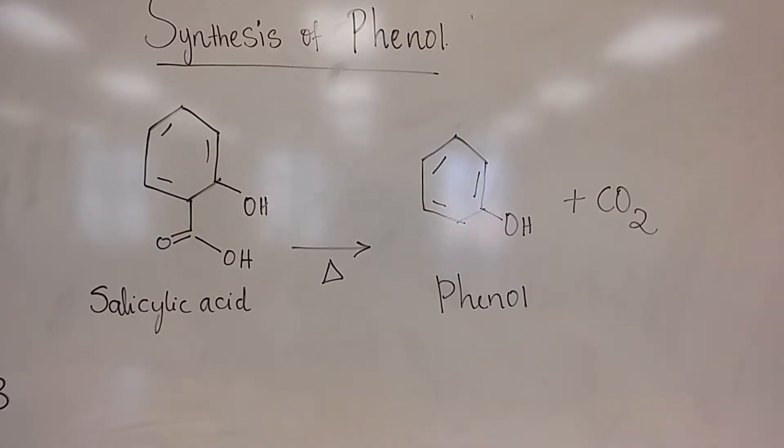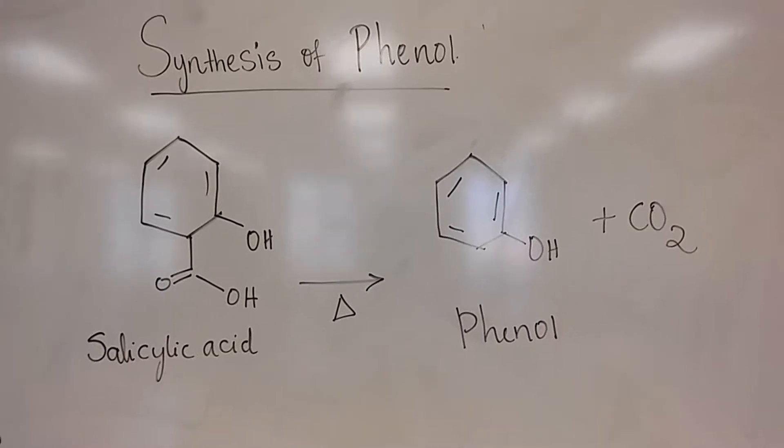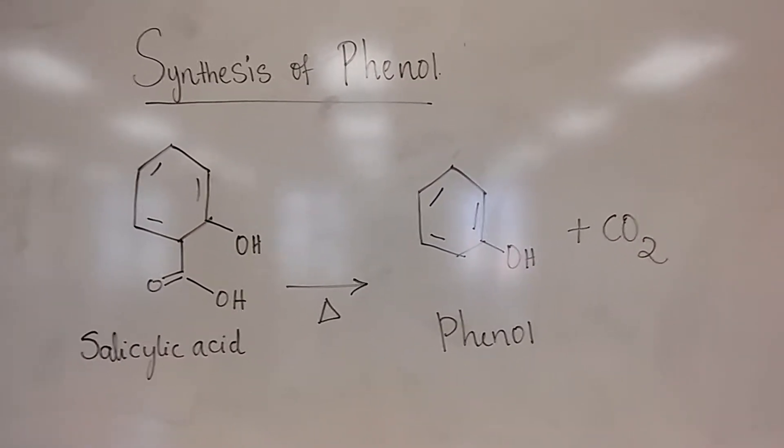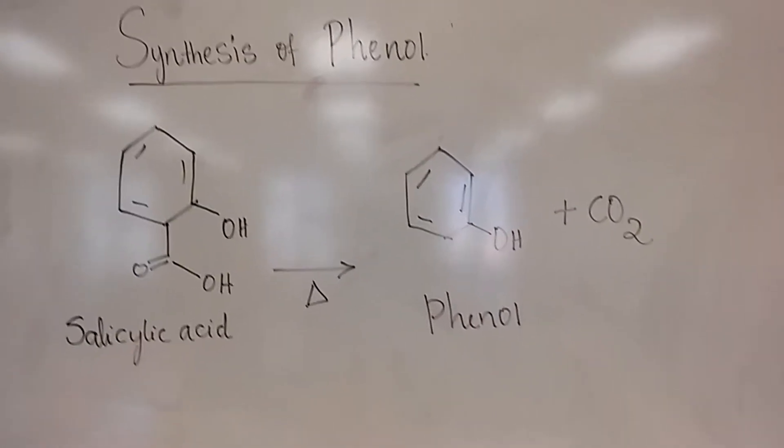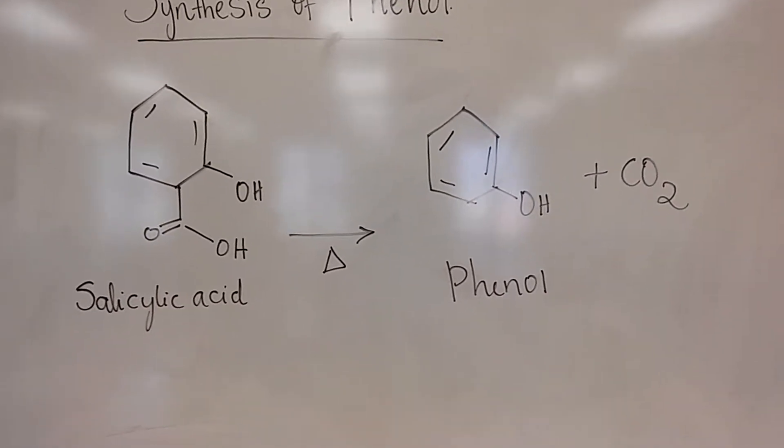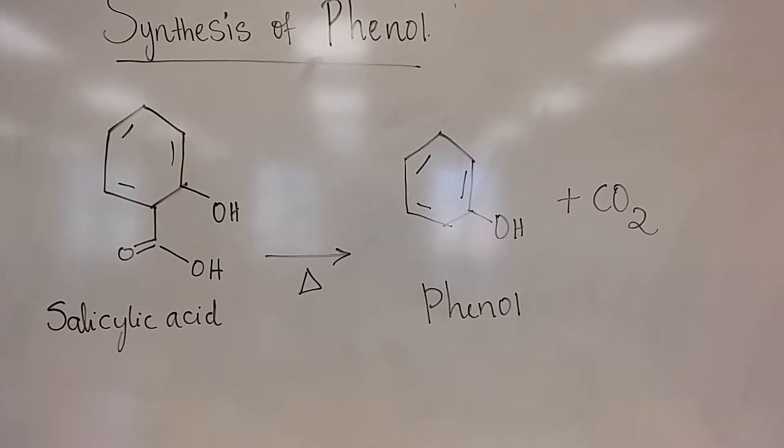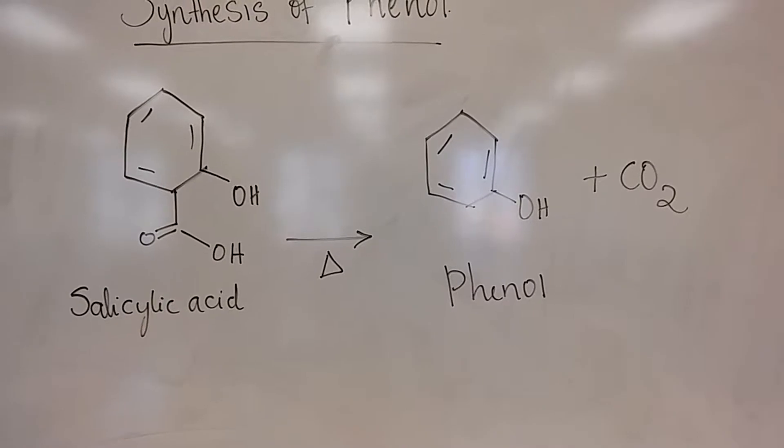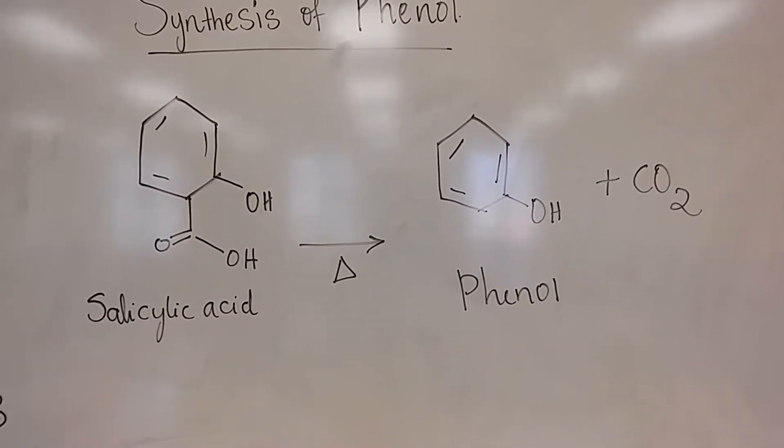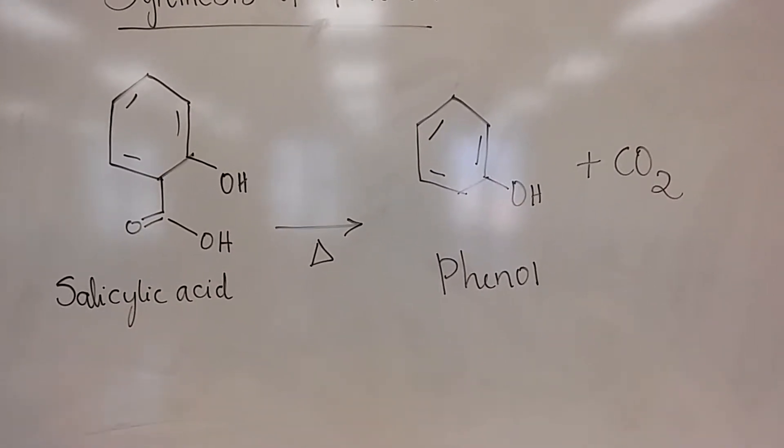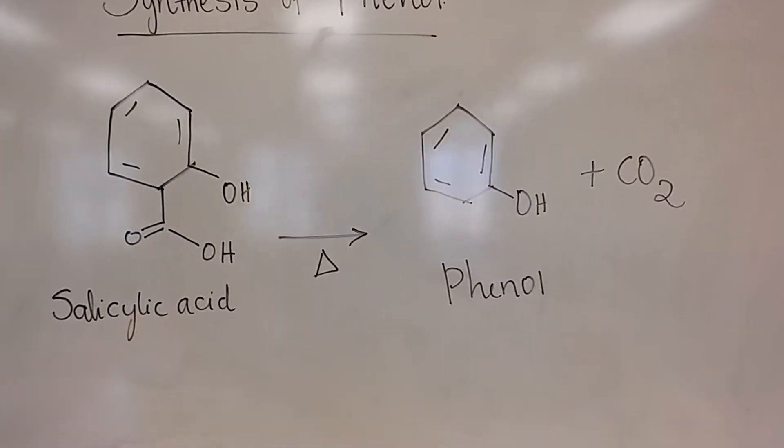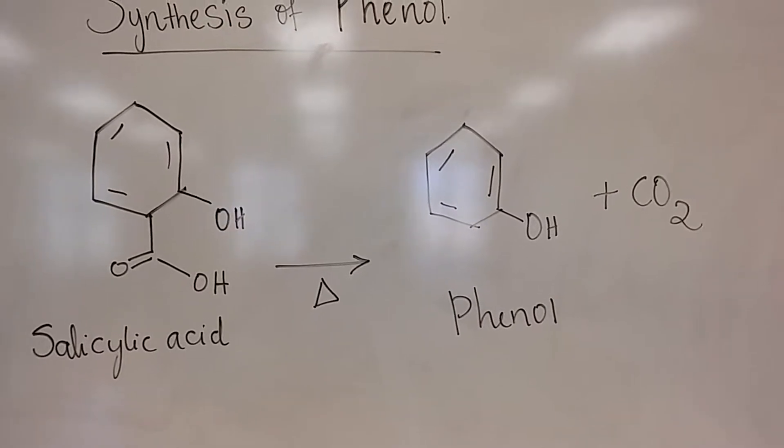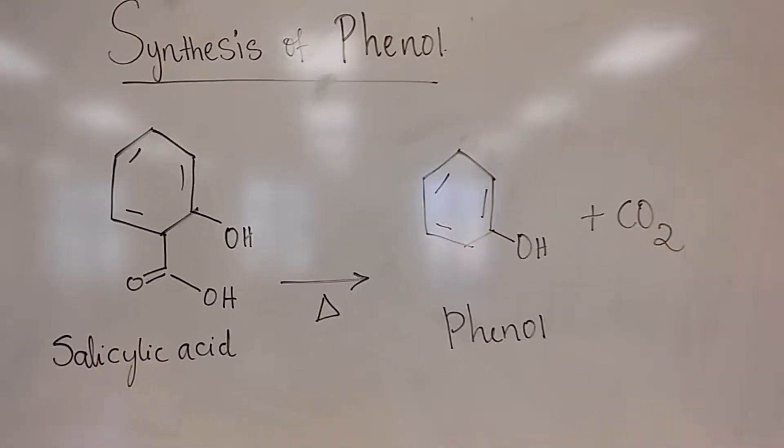To actually allow you all to see the CO2, I'm going to do something you probably have seen in your general chemistry class. Because CO2, when it combines with water, makes carbonic acid, which is a weak acid. So what I have done is taken a beaker with water with a universal indicator. Currently it's kind of orange-ish color, and then when the CO2 gets bubbled into the water, you're going to start to see the color change, going from neutral, which is pH of 7 for water, to a slightly acidic pH.